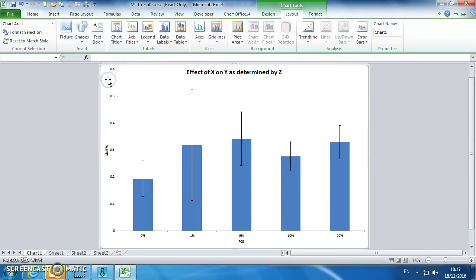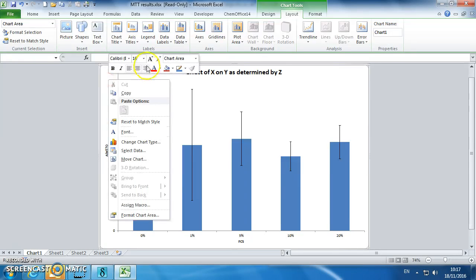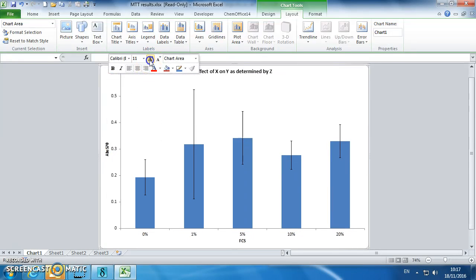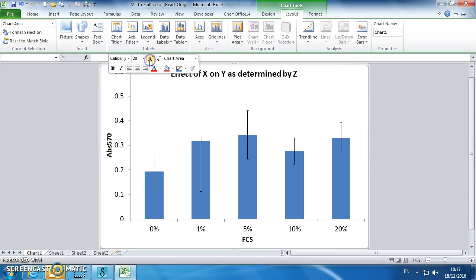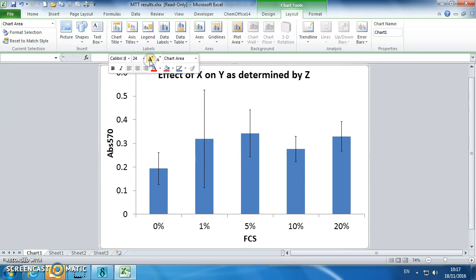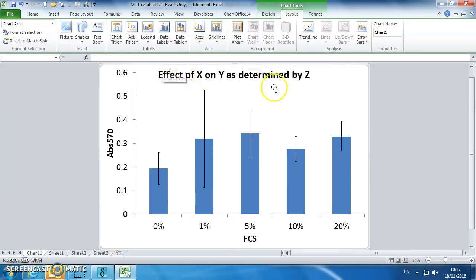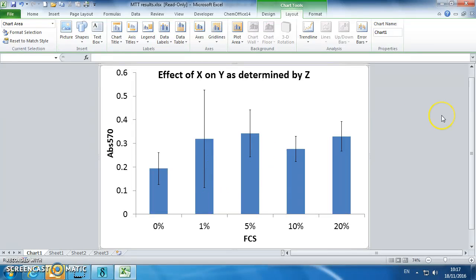To make your graph look nice, increase the text size, so that it's nicer proportion, so that when you copy it out into a Word document, the text isn't too small. Oh, your significant stars.